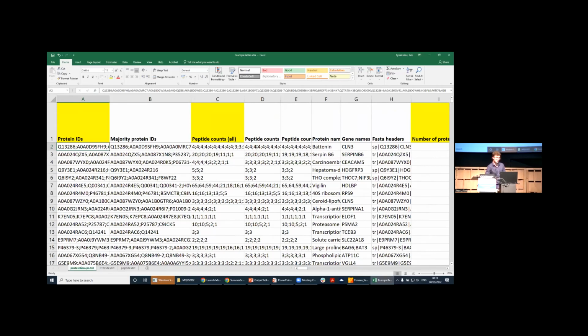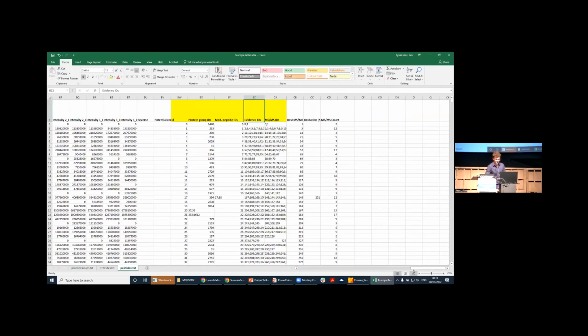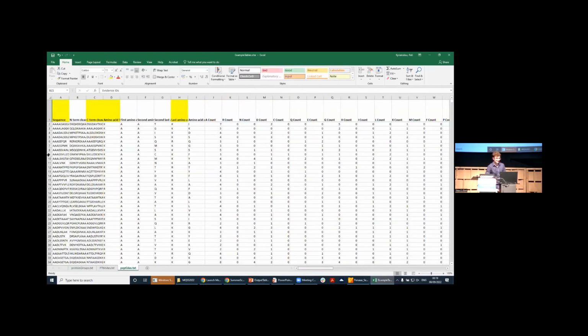So we had here 4 peptides involved in this identification. So we can look at the peptides table and then go to the far left. On a peptide level, it doesn't make sense to have protein IDs or something, but here, what actually identifies this peptide is basically its sequence. So that's the stuff that constitutes a peptide.